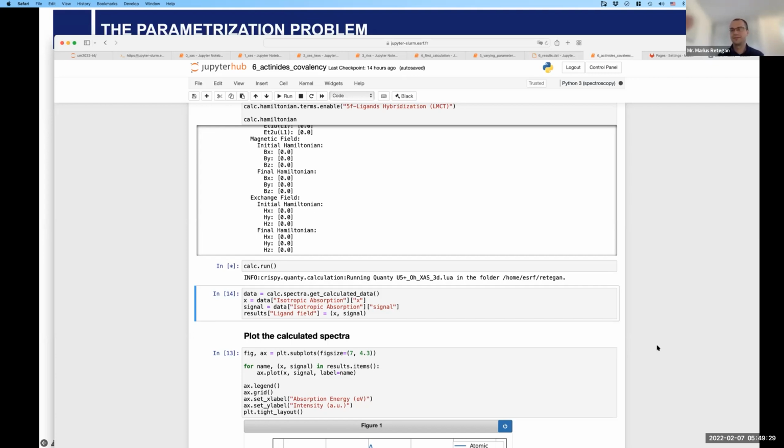Yeah. The problem I see with this notebook is that, of course, you know all your commands, but if you are not familiar with all these Python packages, you don't know which commands are available. It's very nice to see you typing in things and changing things, but if you don't know about the commands available, say, a list of commands you can use, it's very difficult to use that for your own work. If you sit at the beamline, for sure, then you can always manipulate and analyze your data.